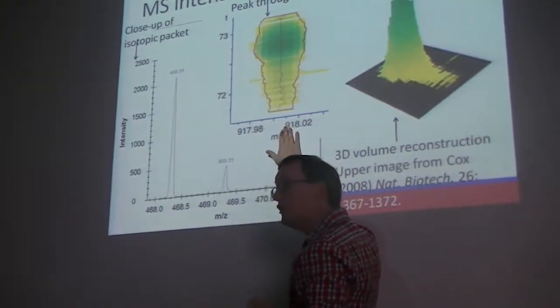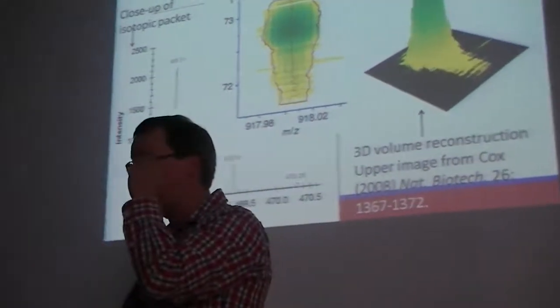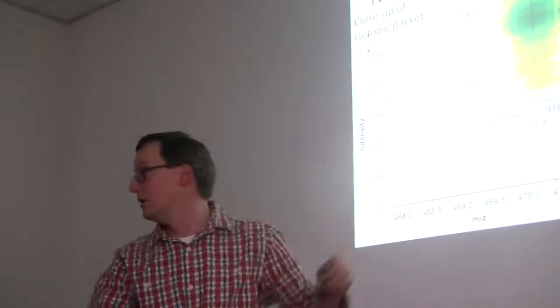So viewed another way, we can make a 3D histogram out of this. We have a peak that shows up, abruptly crests, and then fades away. I think I've mentioned that pattern. That's our chromatogram. But here we're seeing that this peak has a bit of width as well, because we don't get just a single spike in the MS scan. We actually have a peak that has a certain amount of width to it. So here they're zooming that out a fair bit.